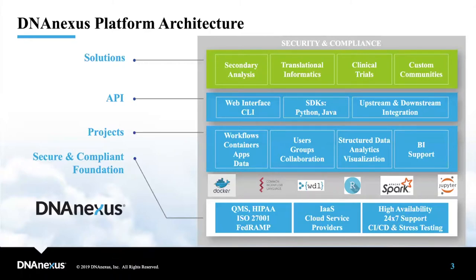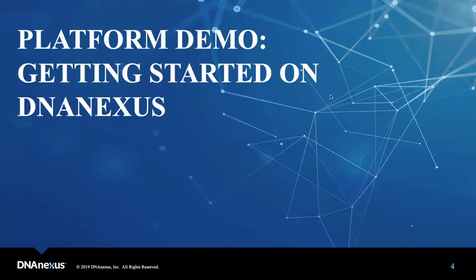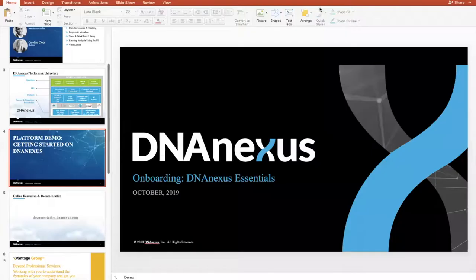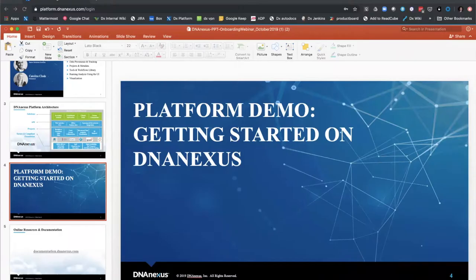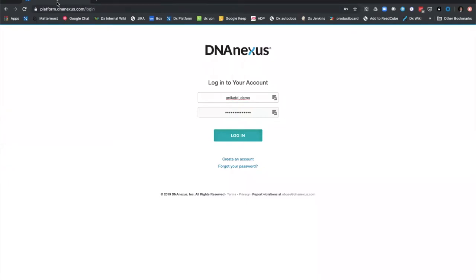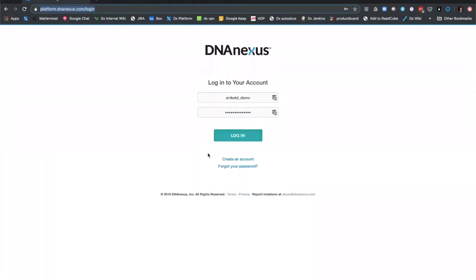I'm going to exit from my PowerPoint and show the actual platform in action. I'm at my web browser, Google Chrome. A user can go to platform.dnanexus.com, and this should take you to the DNA Nexus login page.